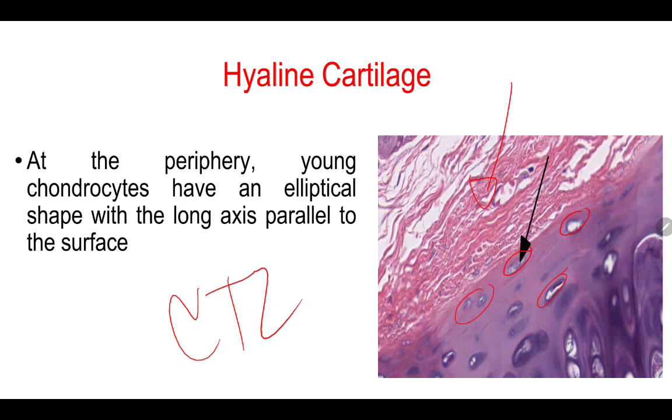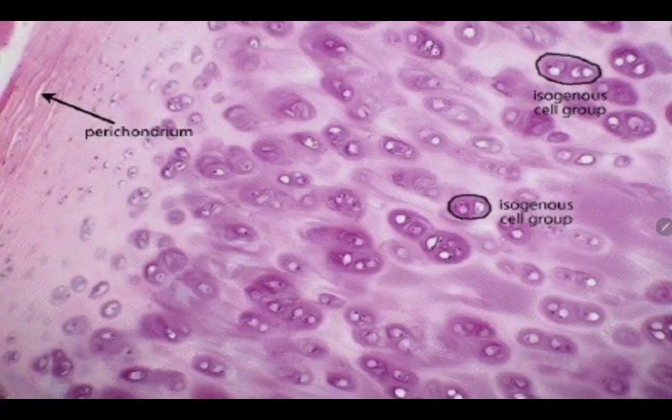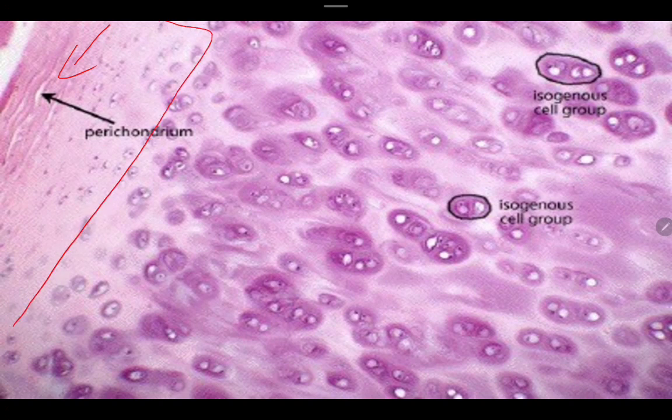Okay? So, let's move on to another picture para mas klaro. So, this is a detailed picture on how chondroblasts move and mature. So, this is the perichondrium, tama? Sabi dito, this is the perichondrium. And then, this is supposed to have the chondrogenic layer. There are multiple chondroblasts na makita. Okay, yan sila.